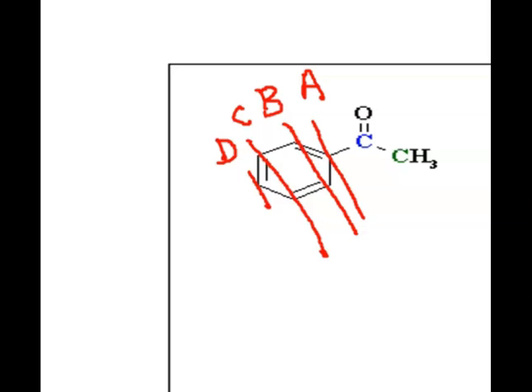Let's look more specifically now at this situation of the benzene ring. That carbon A, we've drawn these 4 lines across this benzene, and this carbon A here is only one of a kind. And so it is unique, and so that's going to get a separate peak on the carbon NMR. But if you look here, these 2 carbons on these points right after that are actually identical. They're both CH, right? They both have a double bond attached to them.